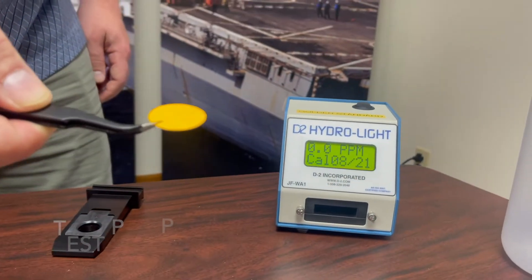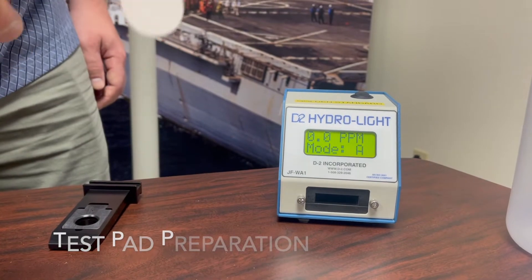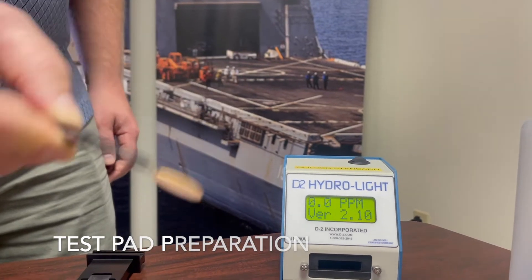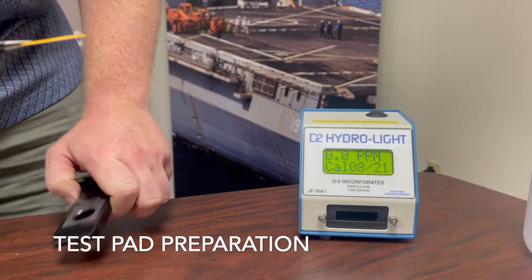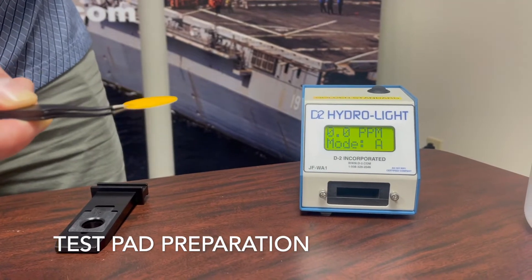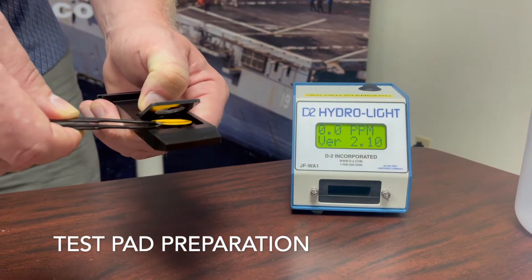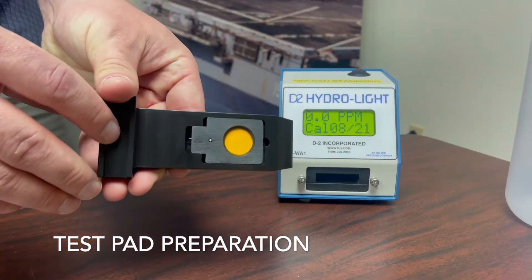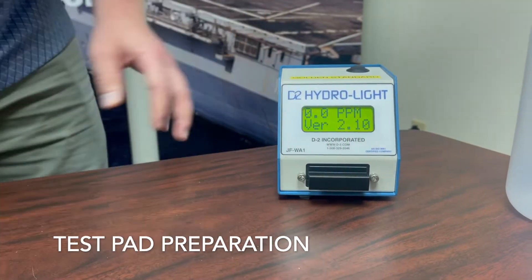When taking a fuel sample, you should always follow ASTM D3240. The pad will be taken facing upstream and have 500 milliliters of fuel passed through it. After this point, the pad is removed from the sampling apparatus. It is blotted using blotting paper per ASTM D3240. It would then be reinserted in your shuttle carefully, face up, color side face up, inserted in your instrument, and a reading would be taken.